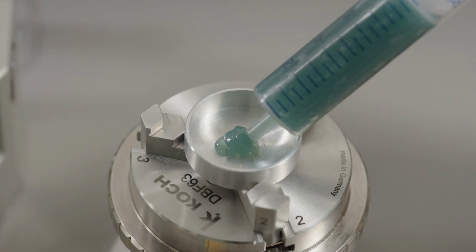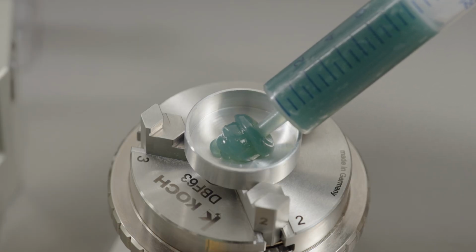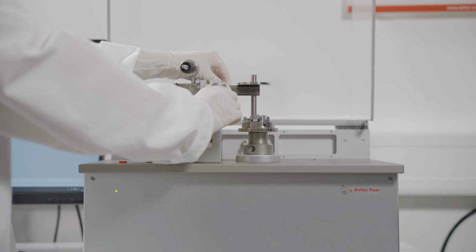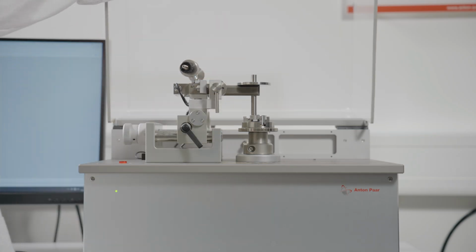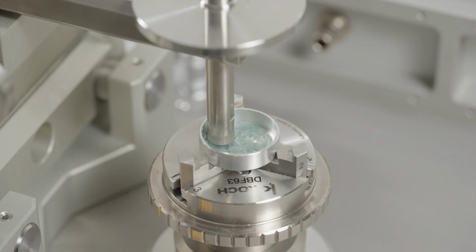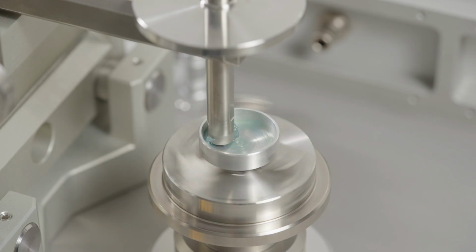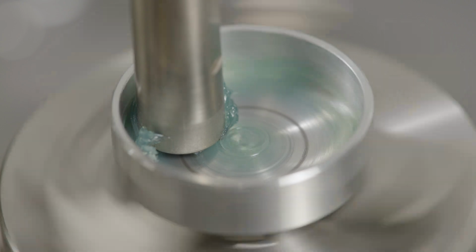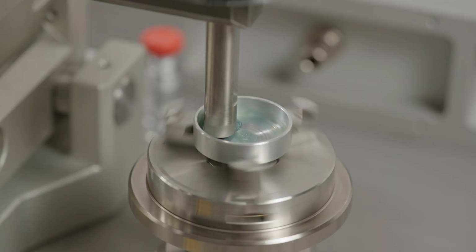In a tribometer test, we introduce a lubricant between two surfaces in relative motion, and we define the test parameters like load and sliding speed. One of the key features of a tribometer is its ability to vary the sliding speed. This is crucial for simulating friction behavior across different operating conditions.